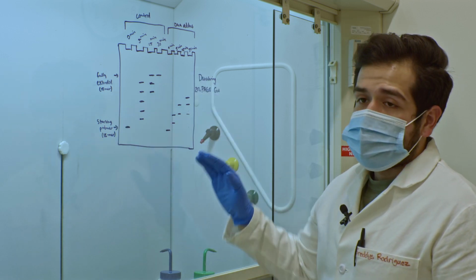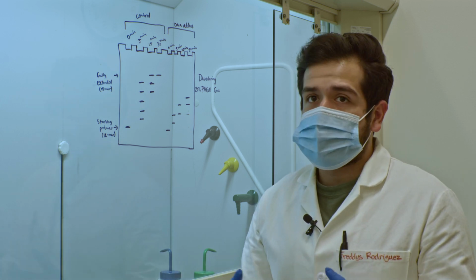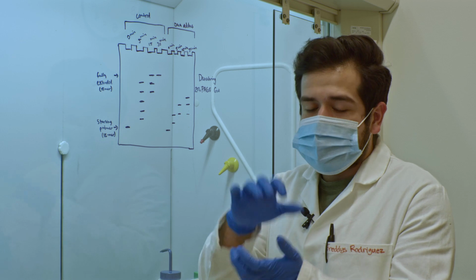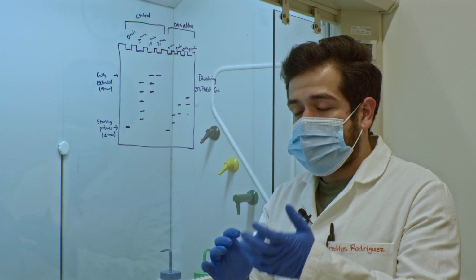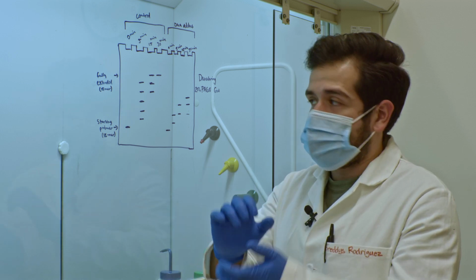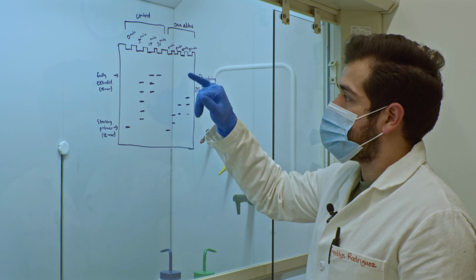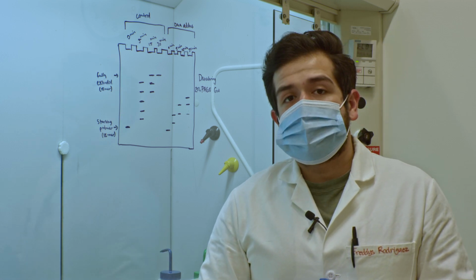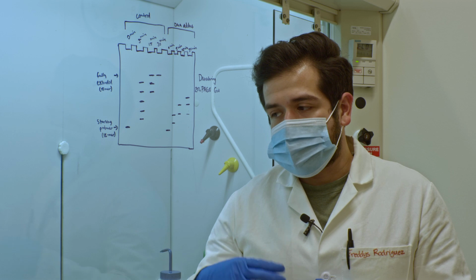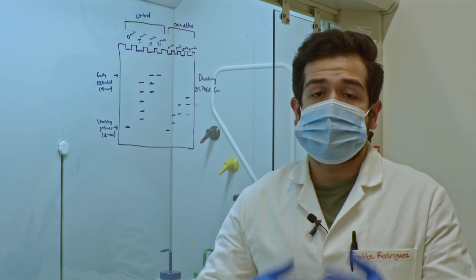But for something like a DNA adduct, because you change the structure of DNA, or sometimes the adduct is so bulky, DNA polymerases can't necessarily fit around the DNA and the incoming deoxynucleotide triphosphate or ribonucleotide triphosphate complex. What ends up happening is that you have a series of shorter extended products, and sometimes you never even see a fully extended product. These assays are also really important when you're doing studies with DNA replication or transcription, and when you talk about things such as viruses, you're trying to test a series of inhibitors, you can run these kinds of assays to see that your inhibitor is actually working.